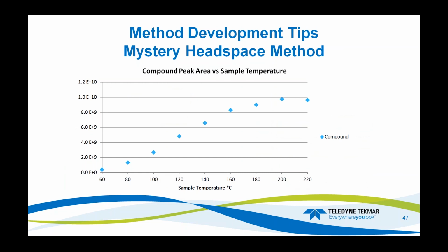So as you can see here, from our study, we created a graph of using the peak area and observed that when we got to those higher temperatures, we were probably overloading the column. That system had maxed out the amount of sample that it could separate efficiently.